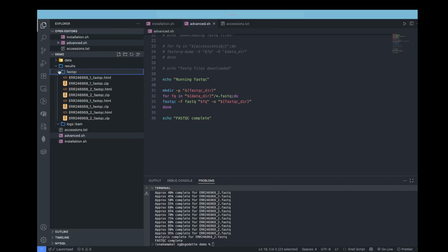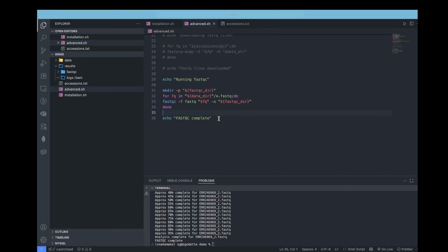So the next thing we want to run is FastP. FastP will not only give you the quality analysis of your reads, it will also trim the bad reads from your data. Now, this can be beneficial in very many ways because you don't need to manually interrogate your files to trim the poor quality reads. One more thing that is beneficial with FastP is that you can manually set how you want your reads to be trimmed. So to run FastP, we need a few files.